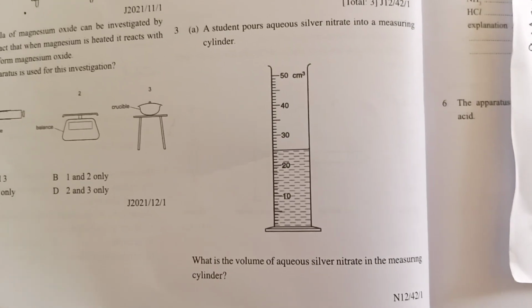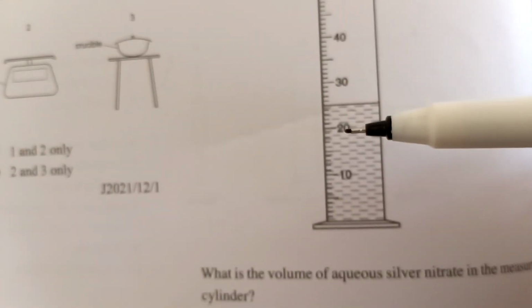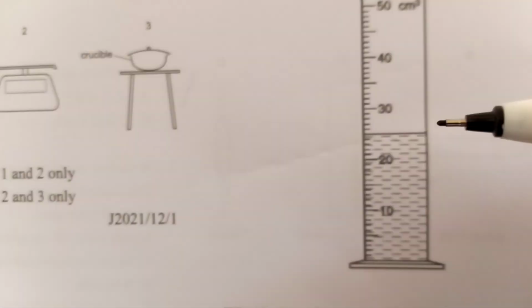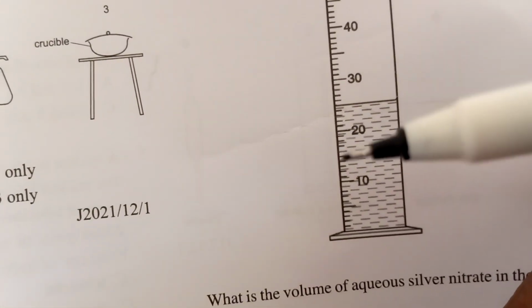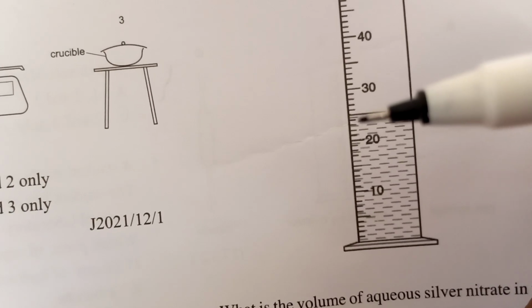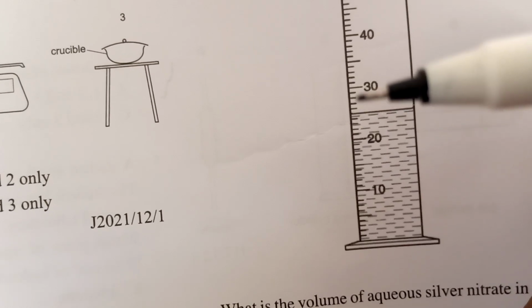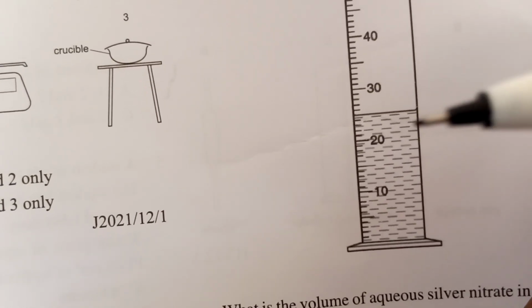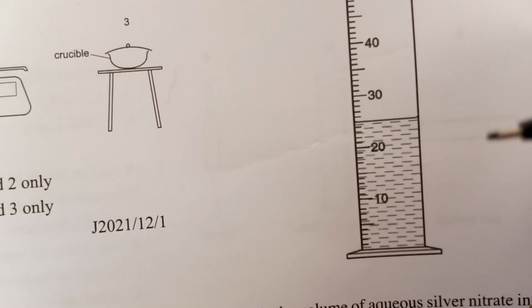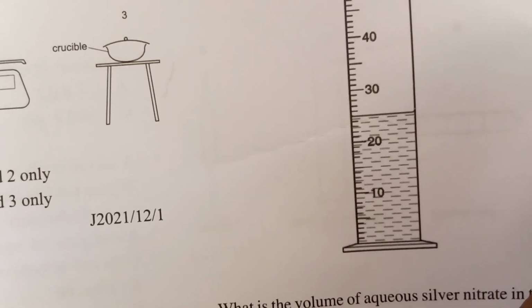Okay, now look at this question. Try to answer this. Very simple. What is the volume? Now the volume is 20. Can you see that here? 20, 20.1, 20.2, 20.3, 20.4, 20.5, up to 25. So it is 25, okay? 21, 22, 23, 24, 25. So the volume is 25.